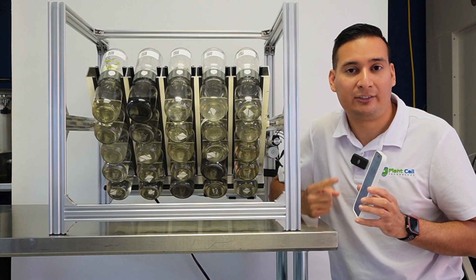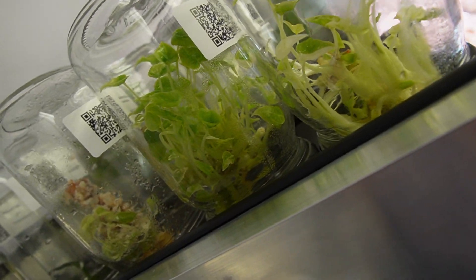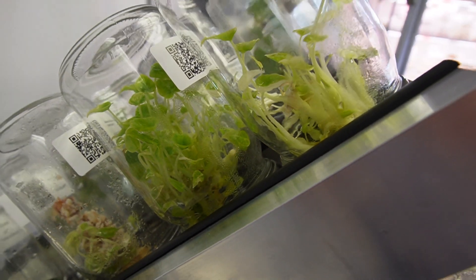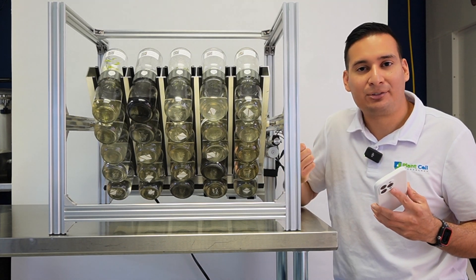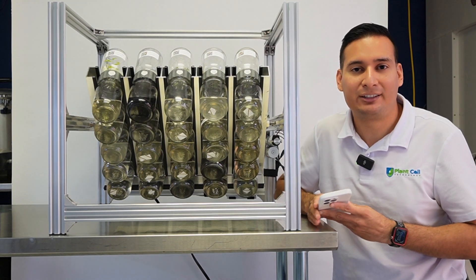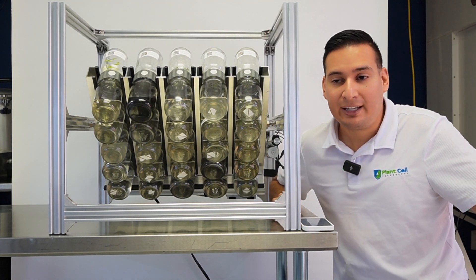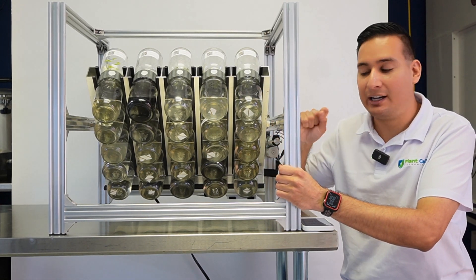You can configure it and then you are set — you don't have to do anything else. You can also control it or change the settings from your phone at any time. All you need is a Wi-Fi connection. I could be on vacation in another country and still change the settings on the BioTill as long as it's connected to the internet.